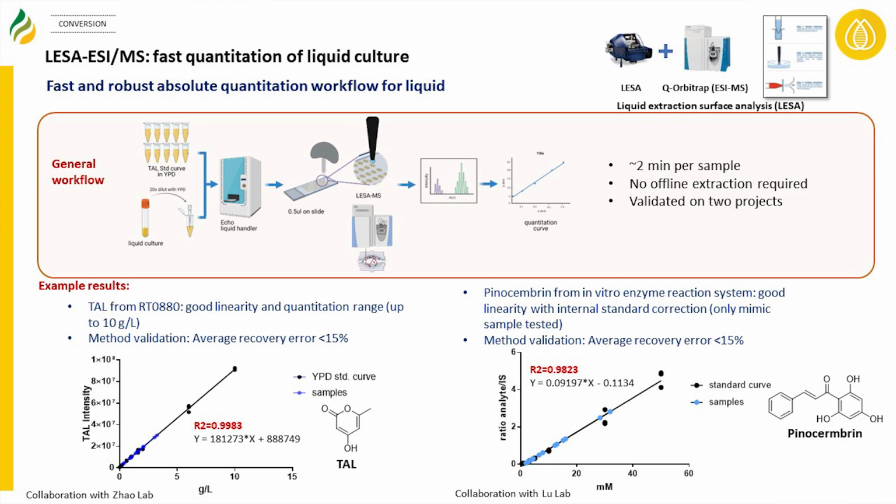These are somewhat unique. If you talk to most mass spectrometrists in your facility, they'll say these aren't as good as, for example, gas chromatography or liquid chromatography in terms of precision and quantitation and complexity. Absolutely true, but if you also tell them I need large numbers of samples, you'll also probably not make as much progress. I thought I would spend the next few minutes talking about other flavors of high-speed measurement.